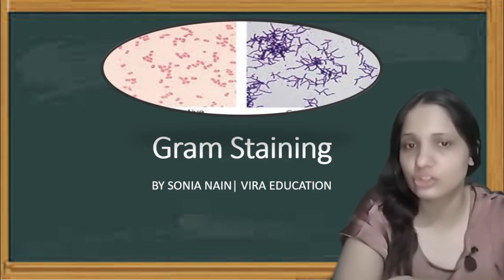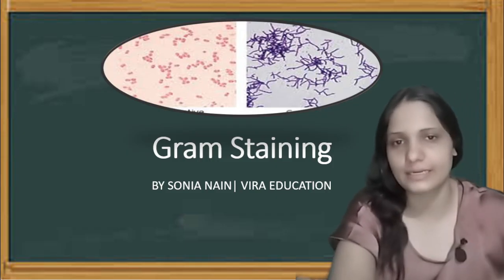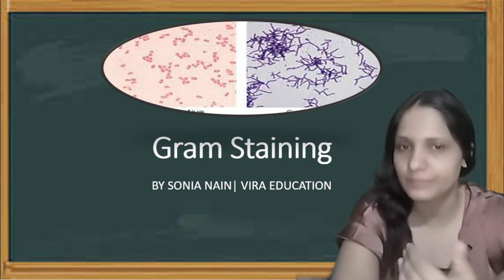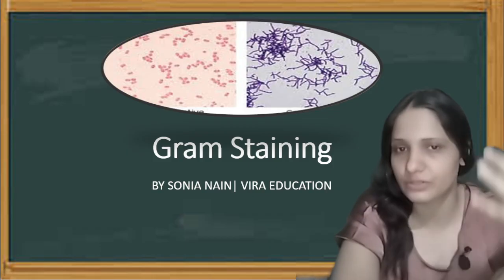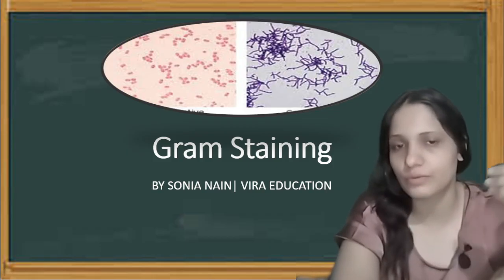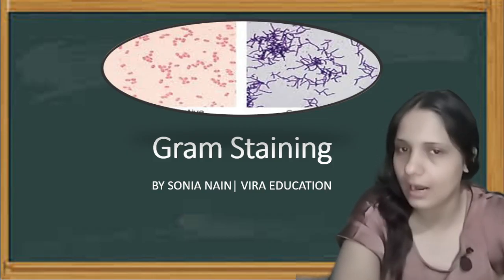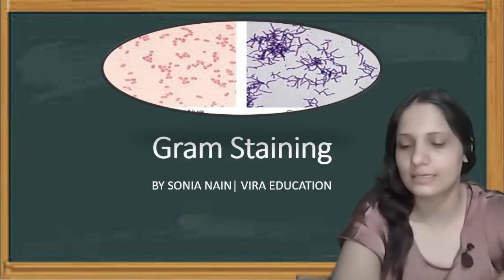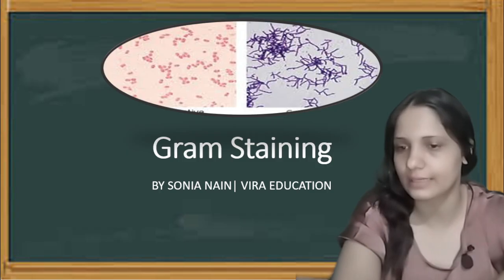And the technique is gram staining. In this video we'll be covering the gram staining technique, its principle, its interpretation, and its procedure. These are the things we are going to cover under this topic. Now let's get started with the class.